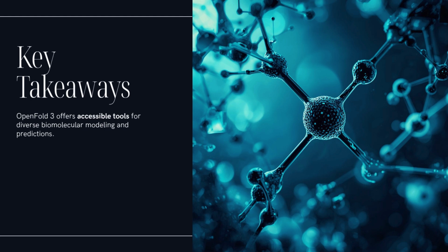So let's connect this back to real research problems. Where does a tool like OpenFold3 actually fit in? What's the "why should I care" beyond just getting a structure? Okay, three quick examples. First, hit triage in drug discovery. We touched on that with the ligand prediction.